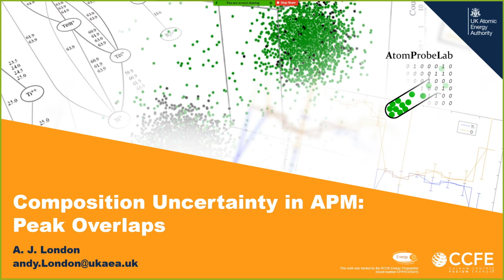I'm going to talk to you about Atom Probe Lab, and the background of this is it's Matlab code that I started when I was doing my PhD in Oxford way back in 2011. As I mentioned previously, Matlab has changed a little bit since then. It's been, I don't know, maybe a slightly bumpy road.